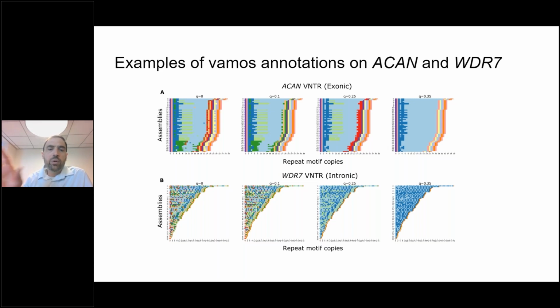One question that we often get is whether we're able to annotate with all levels of compression. That's not currently supported in the software, but it's relatively straightforward to run it a few different times and have one VCF that represents all of the different levels of tandem repeat compression. It's not too hard to do, but we don't quite have it yet.